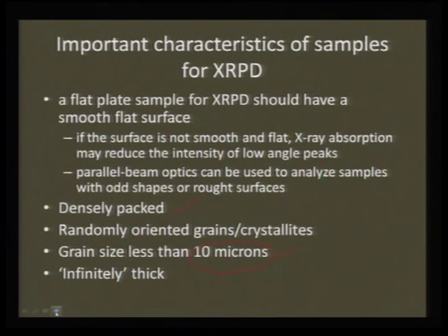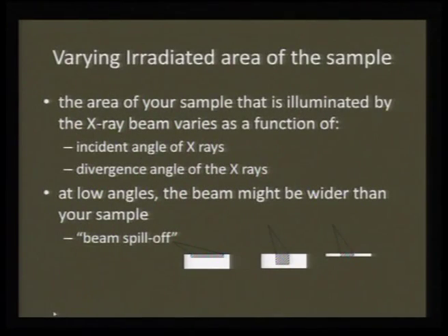And also, you should understand that at low angles, the spread of your beam has to be this big, whereas at very high angles it can be very small. Therefore, when you spread the sample, we should make sure that at all angles the incident radiation is falling exactly on the sample and not elsewhere.